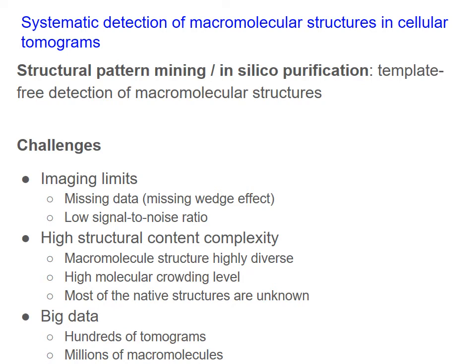We have been working on developing different methods to systematically detect macromolecular structures in such cellular tomograms. In other words, we have been developing methods for structural pattern mining, or in silico purification, to do a template-free detection of these macromolecular structures in such image data.